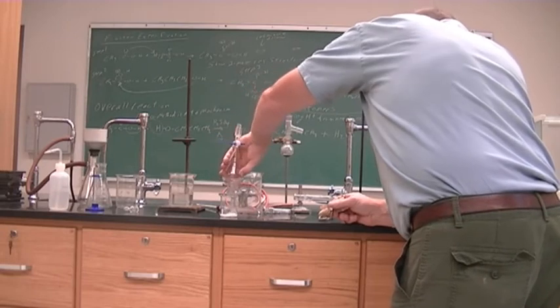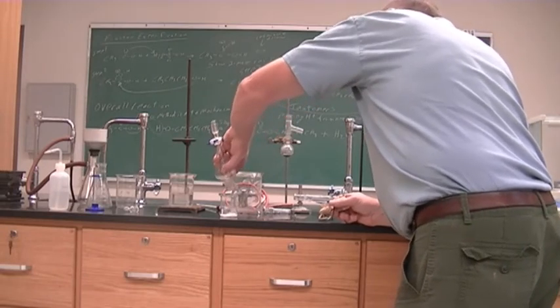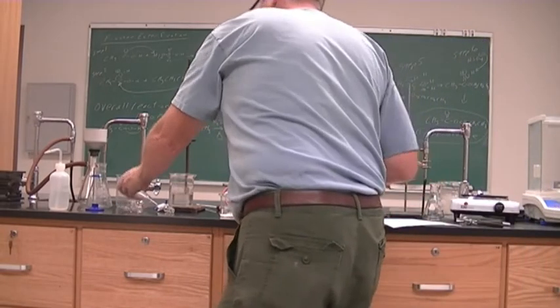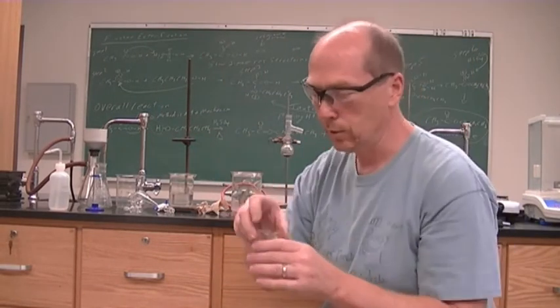Alright, so now we take our liquid, we put it on a drying agent. Again, a drying agent, we're drying our liquid. All that means is we are taking the water out.